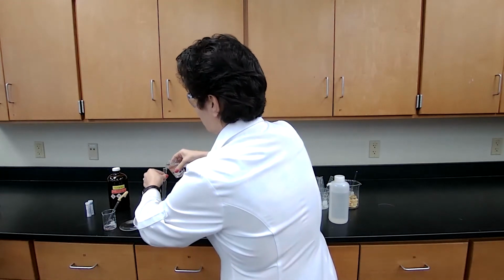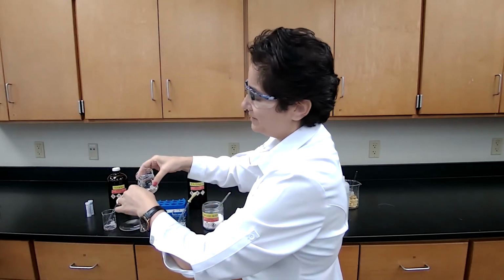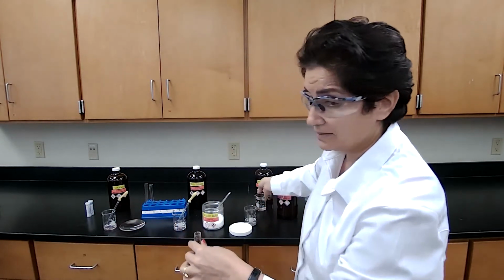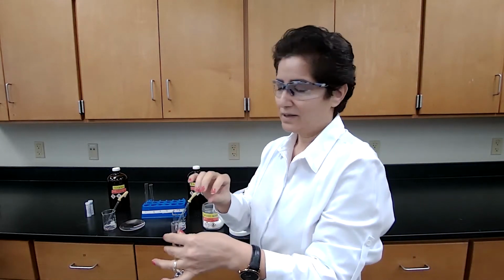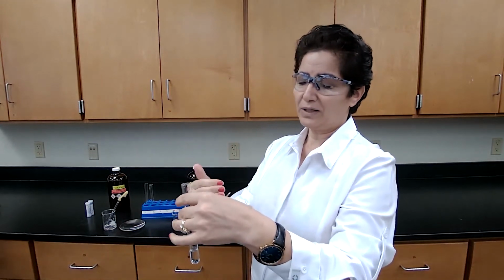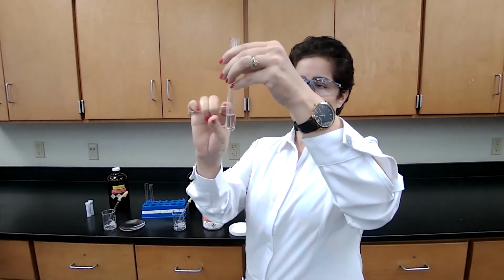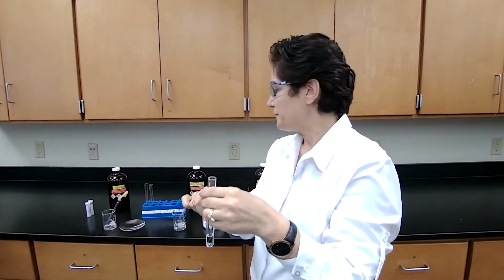About 1 inch is approximate. And with the approximate, what we have to be careful is that we don't want our solutions to get saturated. So we can't add too much of a solute and too little of the solvent. But with the procedure that we are doing, we are just adding 1 drop at a time to see if it's soluble or not. It's okay to just use approximate volume of the solvent.